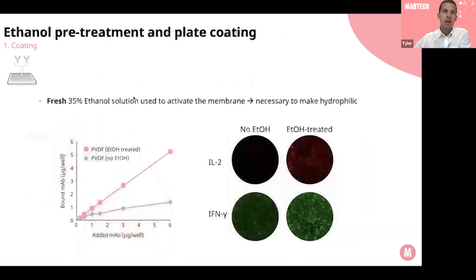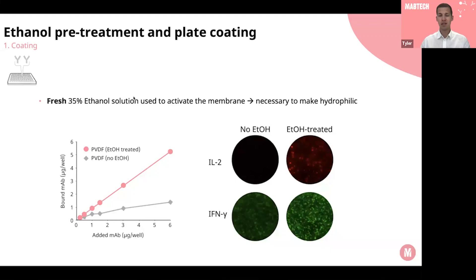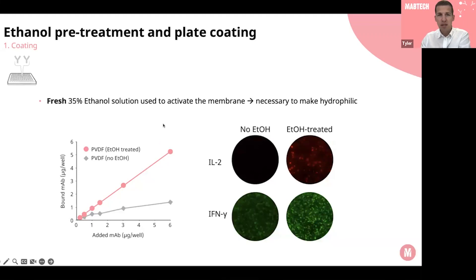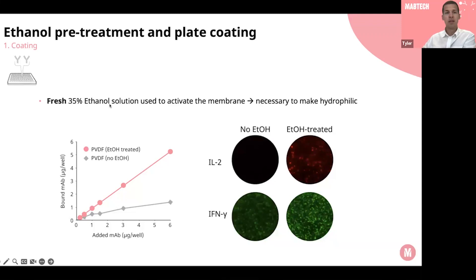First you need to pre-treat the FluoroSpot plates by adding a 35% ethanol solution to activate the membrane, making it more hydrophilic and increasing binding capacity. When you add ethanol you'll see a small color change from white opaque to a slightly gray color, indicating the membrane has been activated. This is a really important step — without ethanol treatment, some analytes like IL-2 can be completely obliterated. There's a clear linear relationship between added antibody and bound antibody after ethanol treatment versus no ethanol treatment.